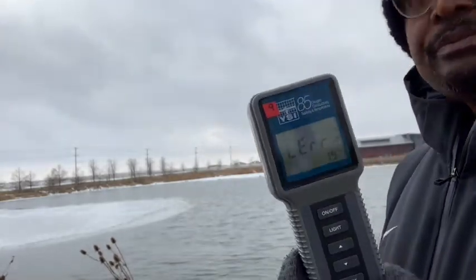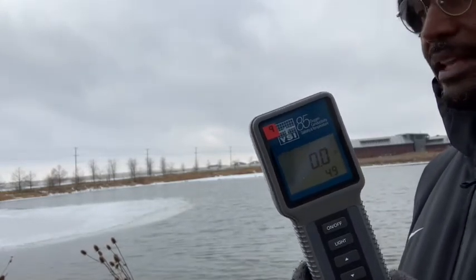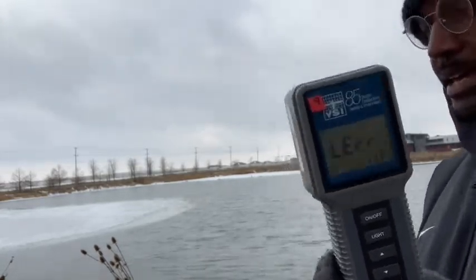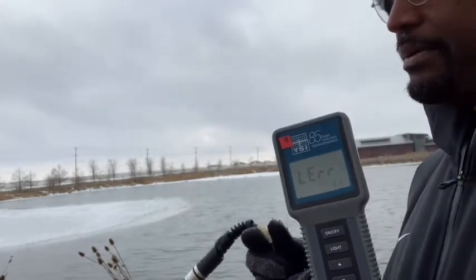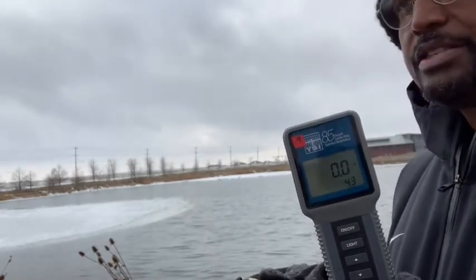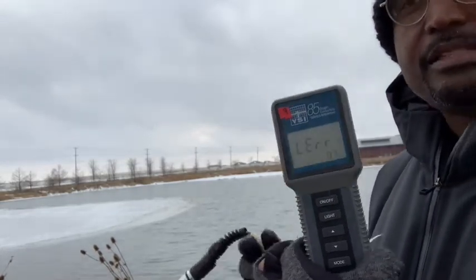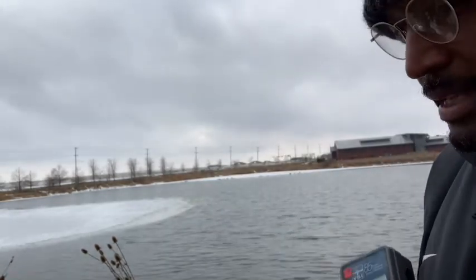And so to find out the delta T, which is the difference between 2 spots in the lake, I would throw my probe into the water. I would record a first temperature. Then I would walk about 10 yards, throw it in, and measure a second temperature. And delta T is essentially the difference between those 2 temperature values that I determined.